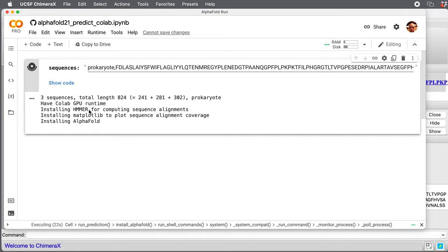Then it's going to install sequence alignment tools, AlphaFold, energy minimization using OpenMM, and then it's going to run sequence searches. It's going to run the AlphaFold neural network and predict structures. That's going to take five hours for this 800 amino acid complex.